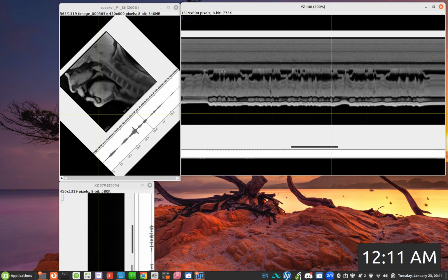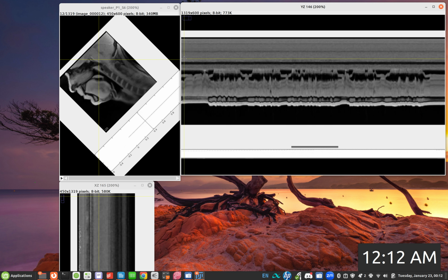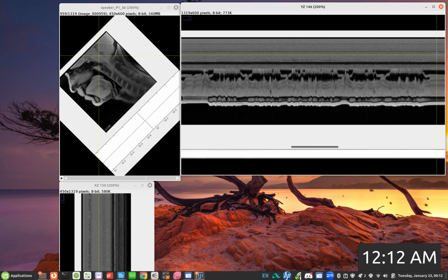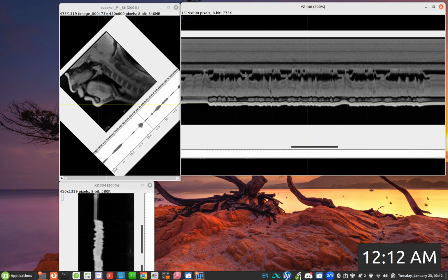Here, the kymograph is taking one slice, one pixel line along this vertical line, and there are 1319 slices, images. So one slice from each image, and they are arranged from left to right. That means these are the stacks. These come from the stacks from the beginning. These are from the end. And what else to look for? The black and white pixels.